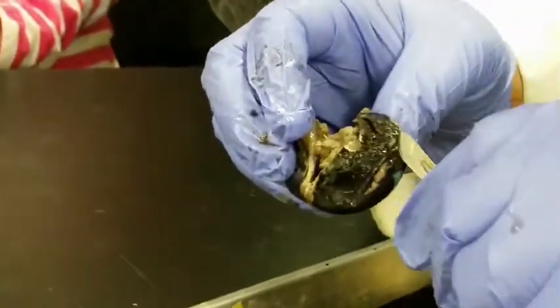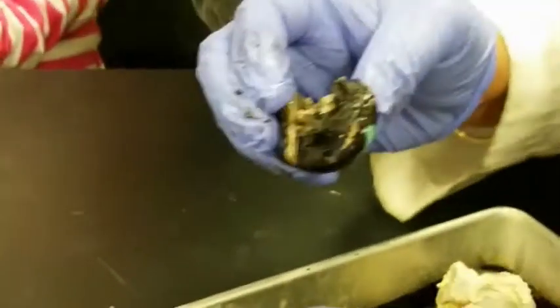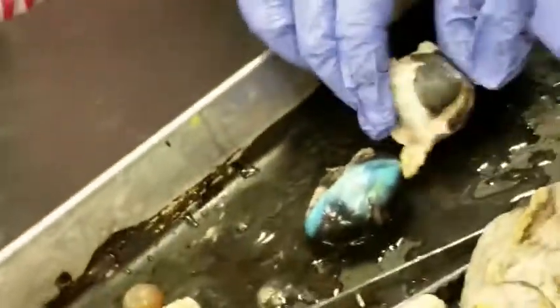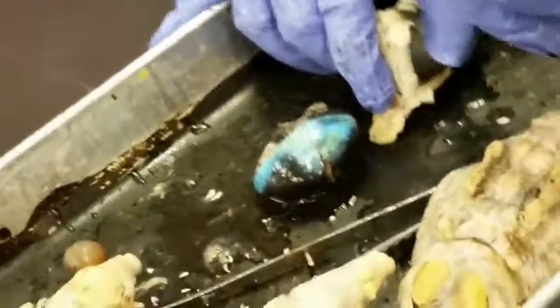Oh, that's the ciliary body. Yeah, that is testable. The ciliary body, that's testable. The lens is testable. The optic nerve is testable, and that's the ciliary body. And I'm going to find one that shows the optic disc. Looks very nice. So let's do another dissection.